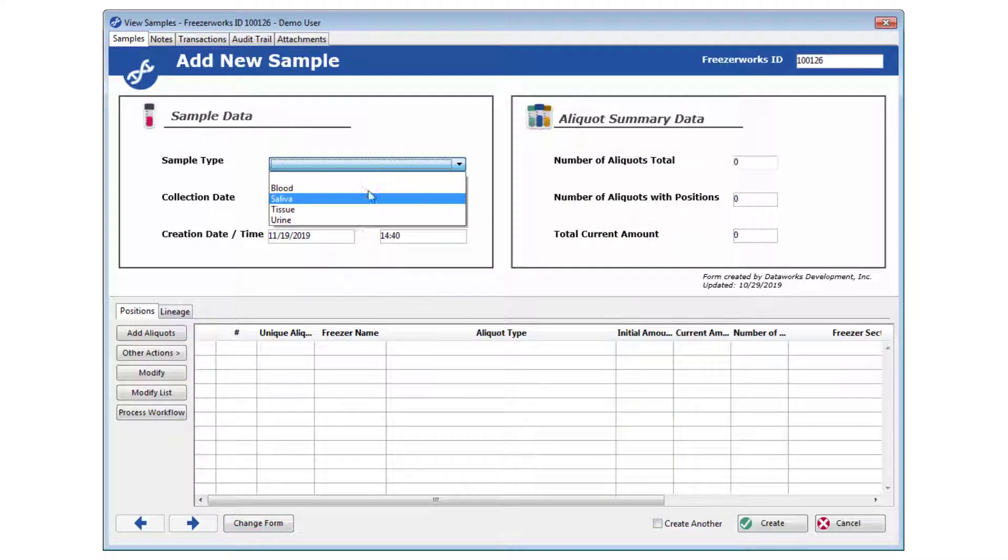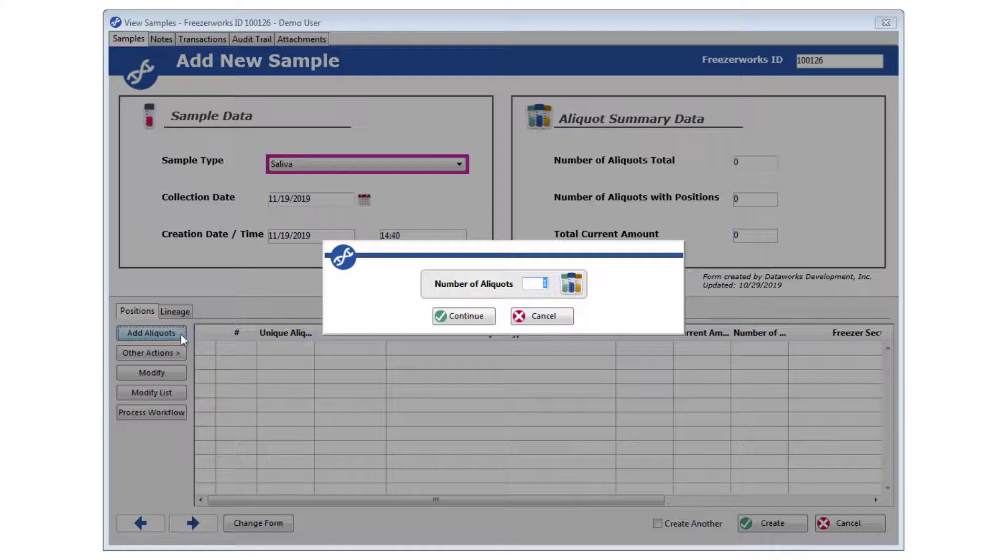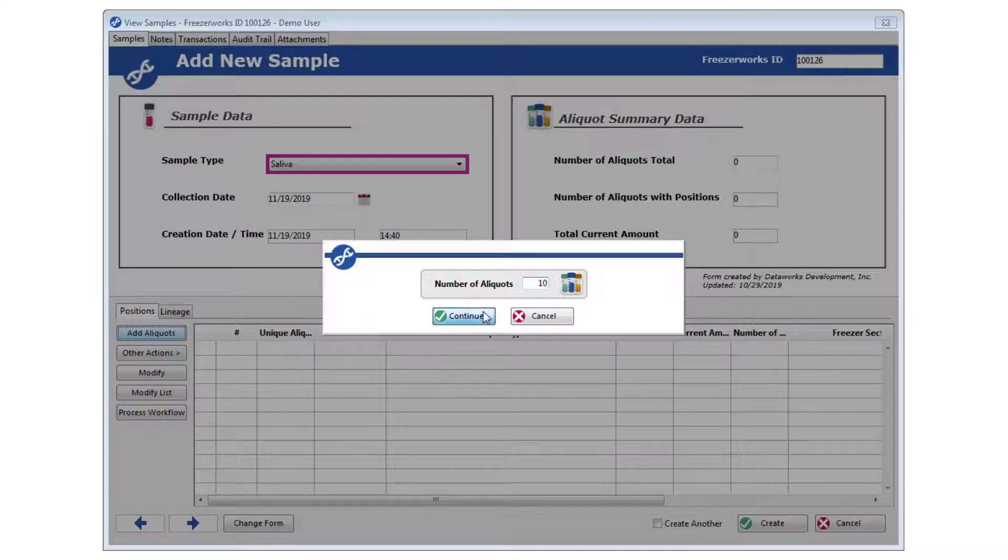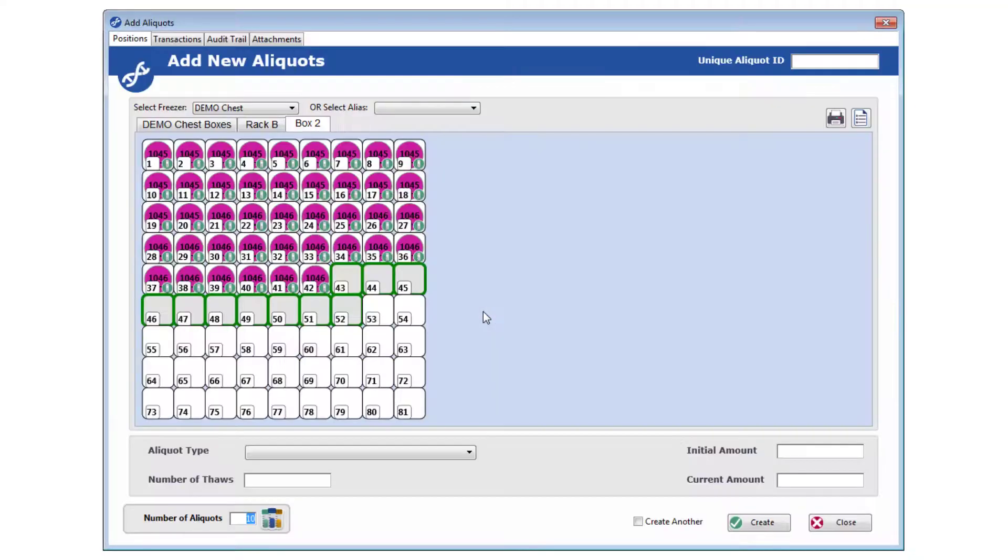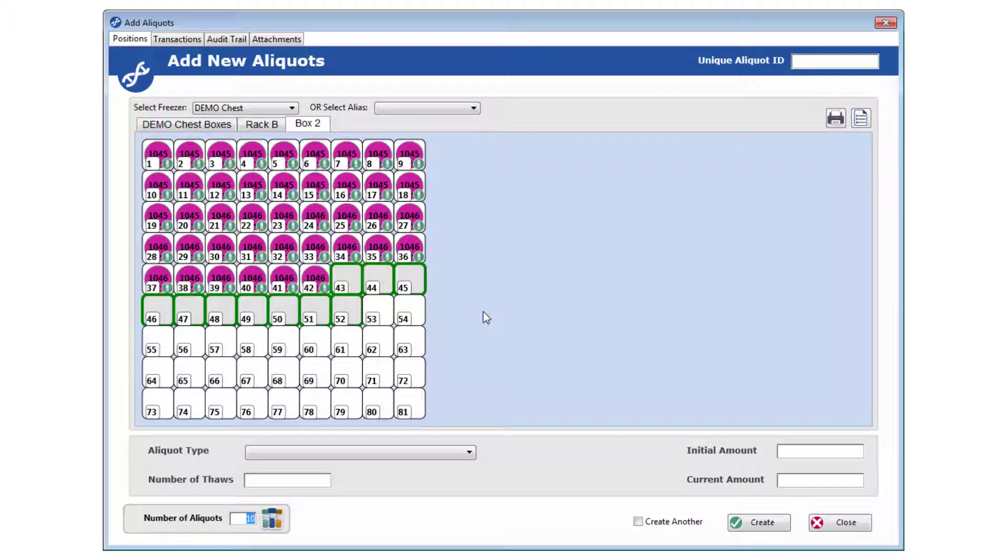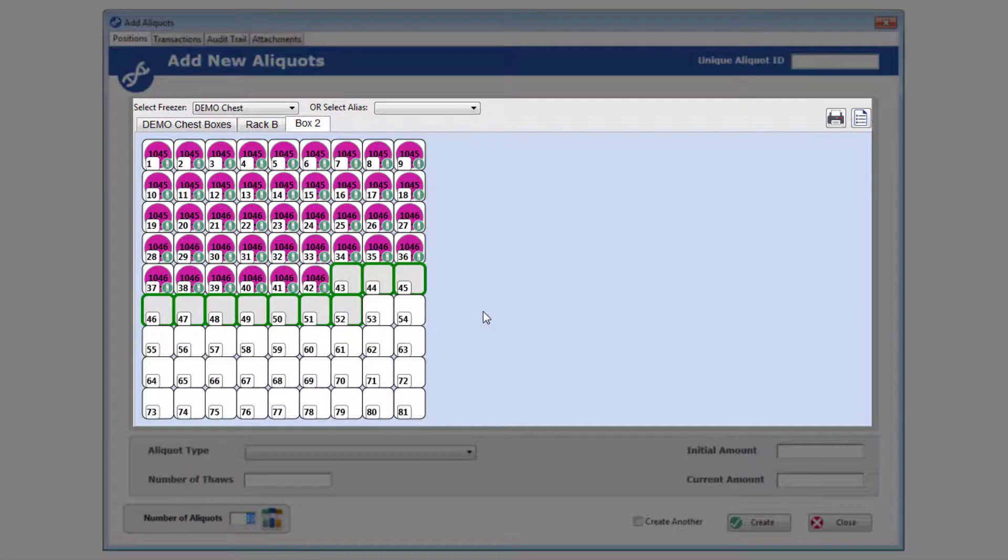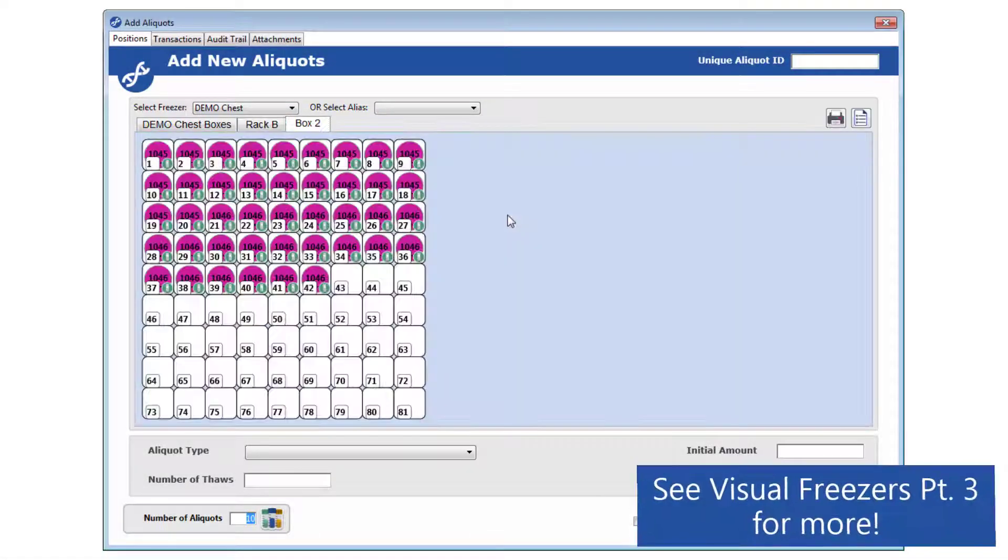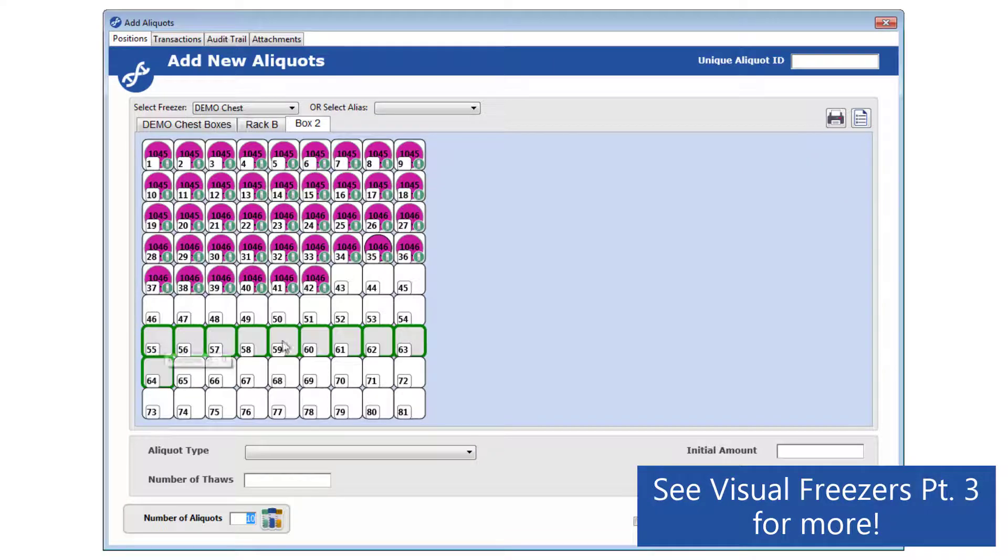Go ahead and enter data if you'd like, and click Add Aliquots, tell the system how many aliquots you want to create, and click Continue. The bulk of this particular aliquots entry form is taken up by the Visual Freezer graphic, where you can find a position to begin assigning all of your aliquots. Part 3 of our Visual Freezer series goes over this process in detail.